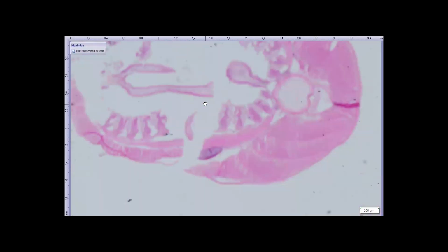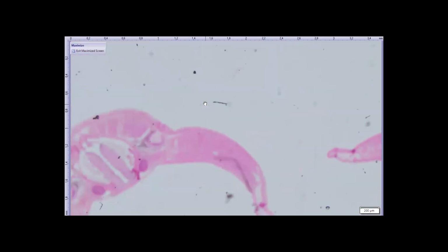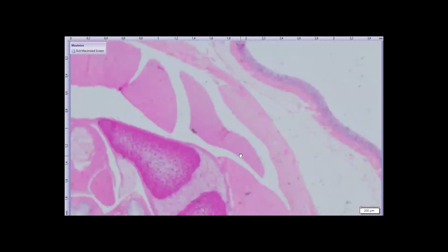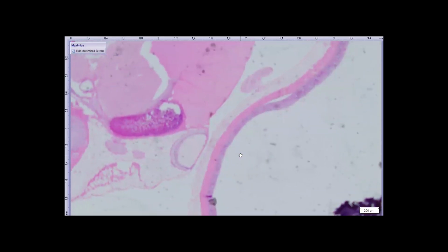So this then is the other jawless fish that we have. This is a hagfish, and I'm going to try and find the eye. Oh no, that's the larval. Excuse me. Here's the hagfish. Wow. There's a notochord. I have to do some searching. Okay, so here's the eye.